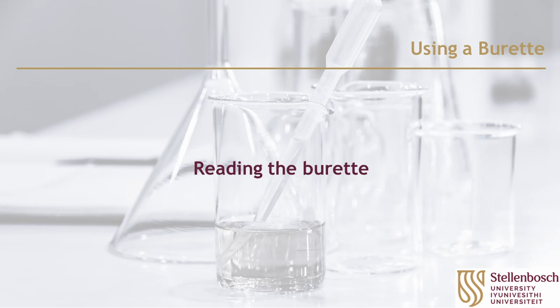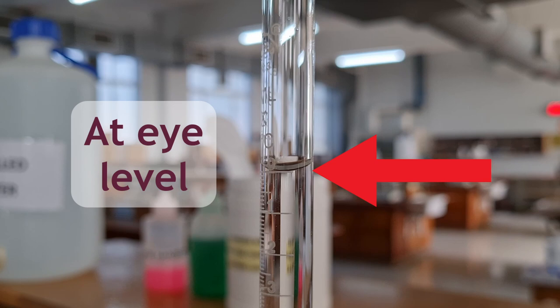Read the burette with your eye on the same level as the meniscus. It may also help you to see the meniscus more clearly if you hold a piece of white paper that has a black streak on it behind the burette. You can use a marker pen to draw this.